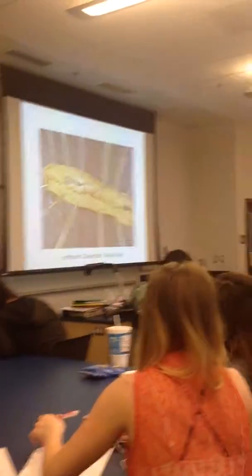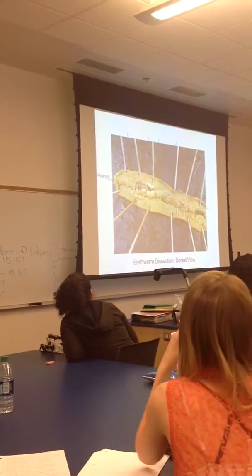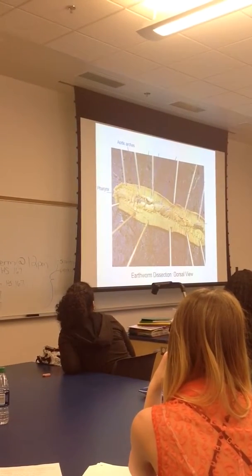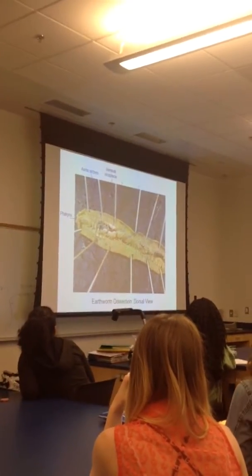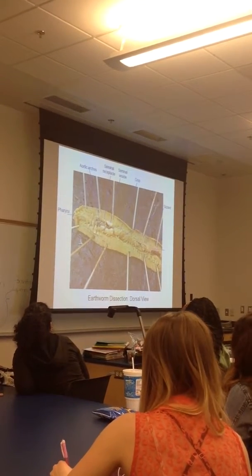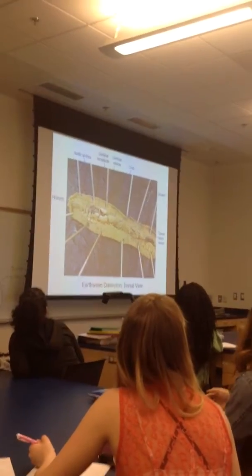A little bit of a different angle. What's this? Pharynx. Good. You're not responsible for that. What's this? The heart. Okay. This. Receptacles, the small ones. What's that? Vesicles. Crop. Gizzard. Intestines. Dorsal blood vessel.